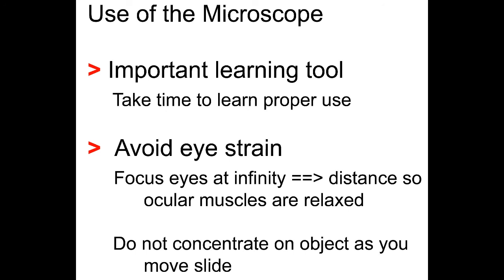So if you keep your eyes focused at infinity, keep relaxed, learn to use the microscope properly, make all of the settings that you need to make, you shouldn't have too much trouble with your microscope. As I said, it's one of the most important tools you'll have at your disposal for learning in the course. If you have any trouble using the scope, please don't hesitate to talk to any one of the instructors in the course.